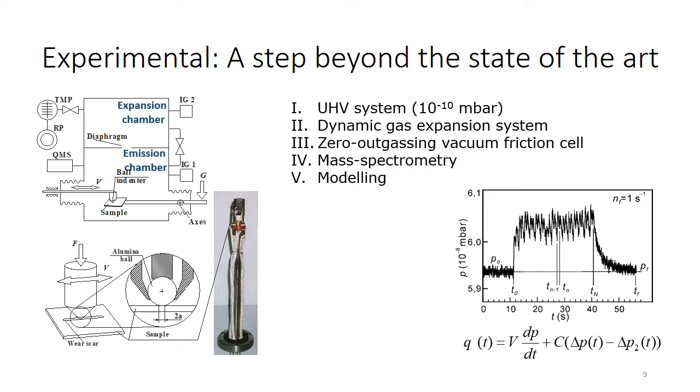We have all these guides and ball bearings outside the vacuum system, connected through the bars from the shafts, and we have sealing bellows which separate atmosphere from vacuum, and inside we only have one mechanical part, one sliding interface, which is between the indenter and the sample.